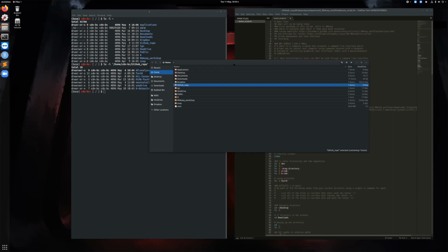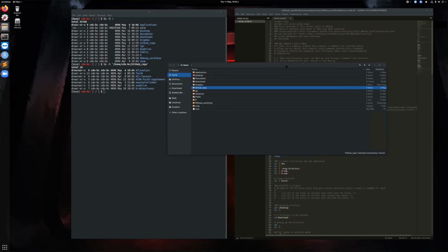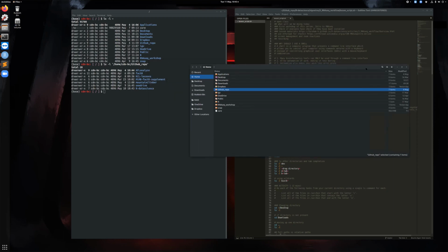And then pasting on Windows, you can't do Control-V, which is a little bit weird. You might want to right click on the window, and right click will immediately paste whatever is on your clipboard into your Git Bash window. So give it a try. It's not completely necessary. Sometimes you might be able to locate your files much more easily than this. So don't worry if you can't figure out how to copy this.